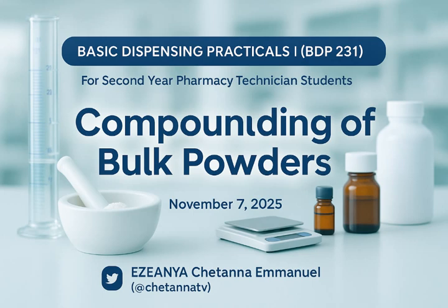By formula we mean a list of all the ingredients you need for a particular preparation and the amount of each ingredient.